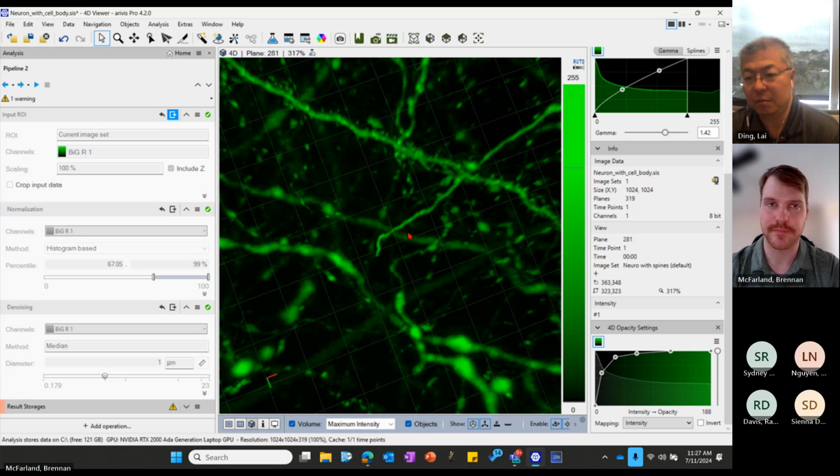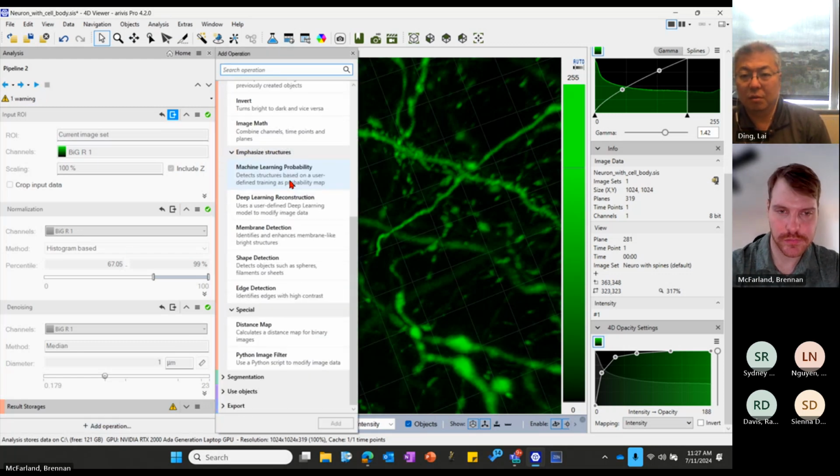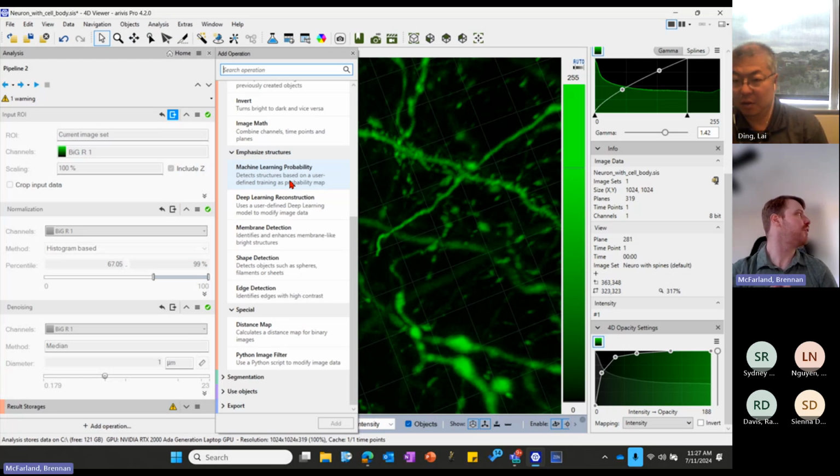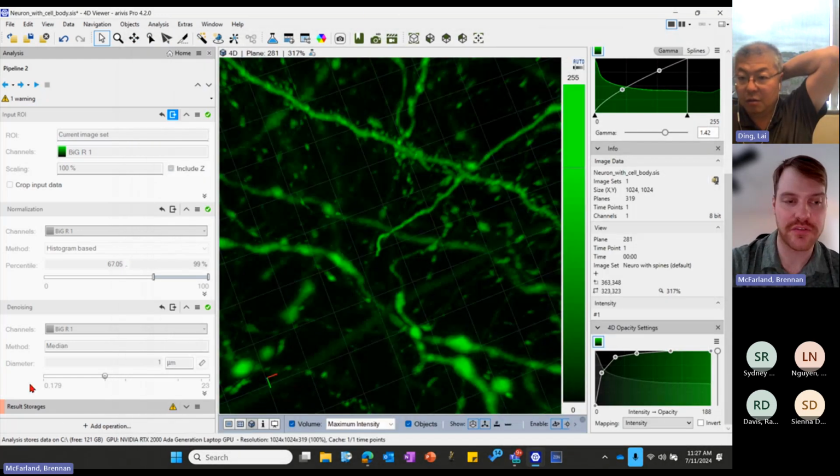Okay. I think that about covers neuron tracing. I think if there's anything else, we also can do, if anybody likes Sholl analysis, we don't have Sholl analysis.